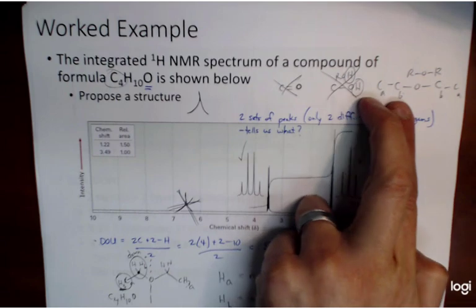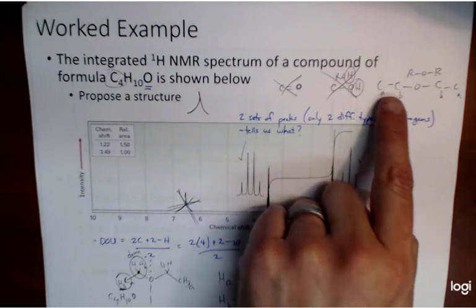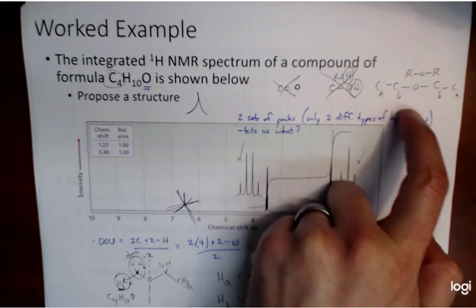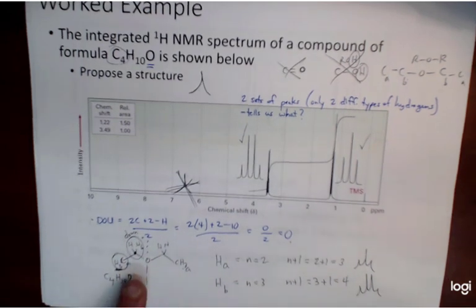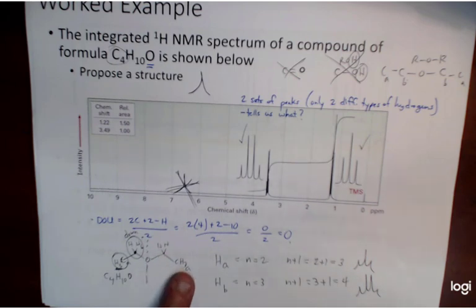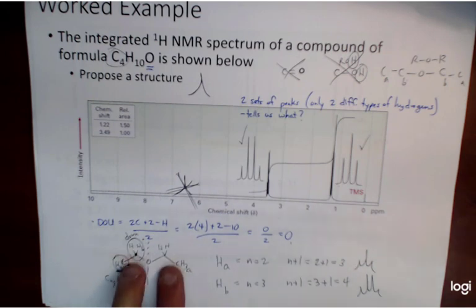If they are the same, say an ethyl and an ethyl, the first 2 carbons attached to the oxygen are the same, and the farthest carbons apart give us the same hydrogen signals. That means we're possibly looking at diethyl ether: CH3, CH2, O, CH2, CH3. Based off symmetry, the hydrogens at the ends are the same, and the 2 middle sets of hydrogens are the same.